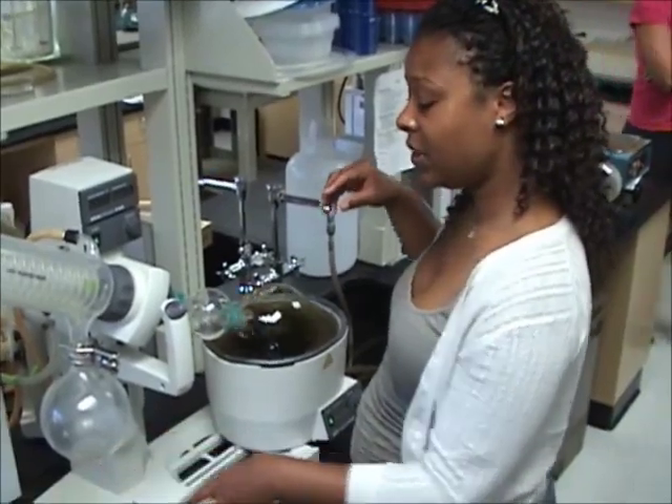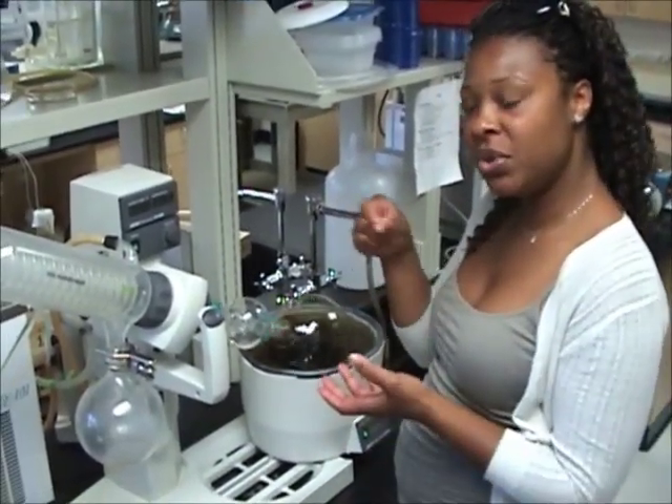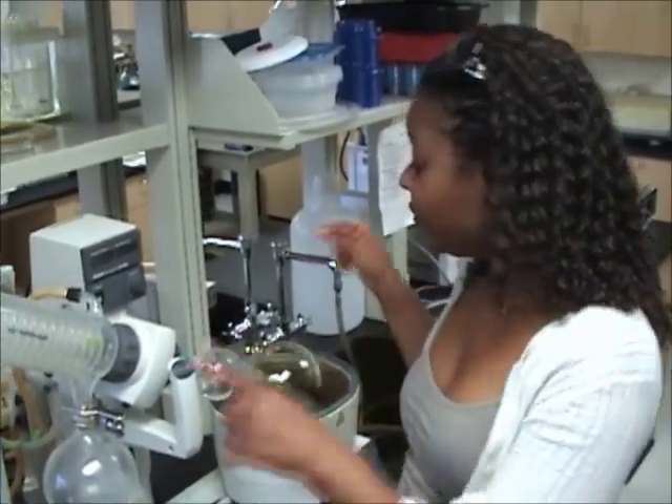Because we've pulled these chemicals out, it changes its consistency. It looks really liquidy right now, but it's going to change to a thicker, more molasses-like substance. And that's what we're working on — we'll continue with what we do with it after that.